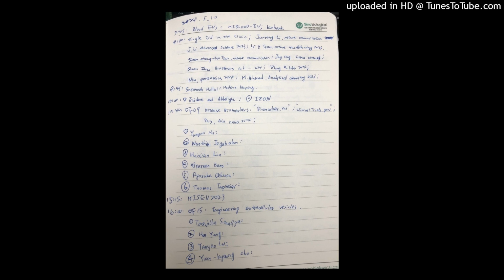To address this, we formulated 4 objectives. First, we isolated and characterized the salivary exosomes from the samples we collected from 3 study groups. Then we estimated the total protein and expression of the cytokines, evaluated the amino acid composition, and finally performed FTIR spectra. This is a brief methodology we followed, and we tried our best to follow all the guidelines of MISEV 2023. We successfully isolated our small EVs, that is exosomes, and characterized them through different techniques.